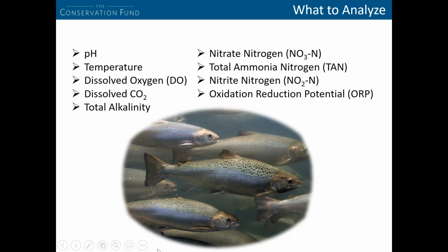It's not listed here, but TSS is also another parameter to consider. Fortunately, unlike a lot of the parameters that you see on this slide, you can see solids in your tank without having to directly measure them. But if concentration gets too high, it could be problematic for your system.